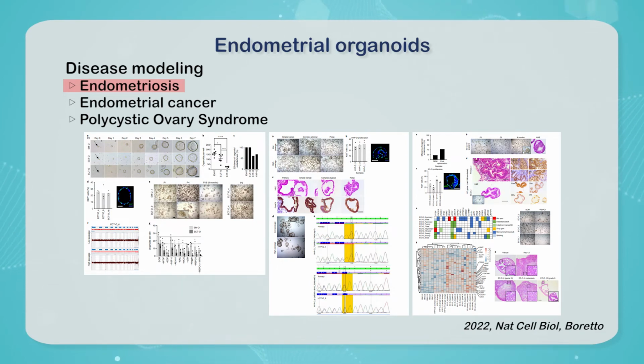Long-term expandable organoids from patient-matched eutopic endometrium and ectopic lesions are shown here. Compared with organoids from eutopic and control endometrium, ectopic organoids also exhibited ERα and PGR expression, microvilli and cilia directed towards the lumen, and secreted mucus into the lumen. Endometriotic organoid biobanks will be valuable in deciphering disease-specific pathogenesis.